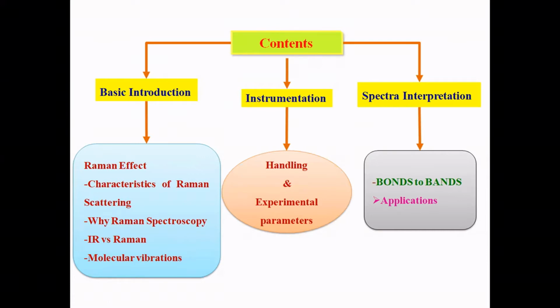And the second part will be the instrumentation. I'll be covering the instrumentation side. So what are the components in the spectrometer, and what are the handling procedures, and a few things about getting a good quality spectrum. For that, what are the parameters influencing the spectra.